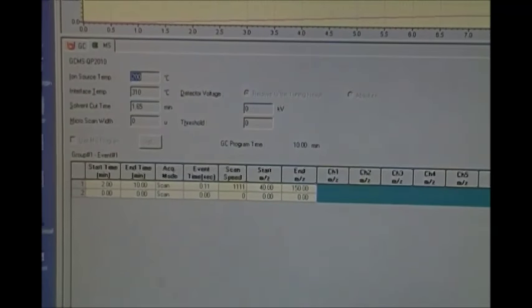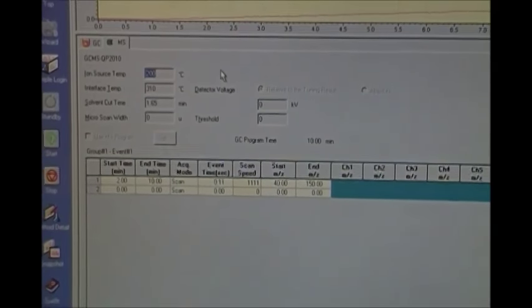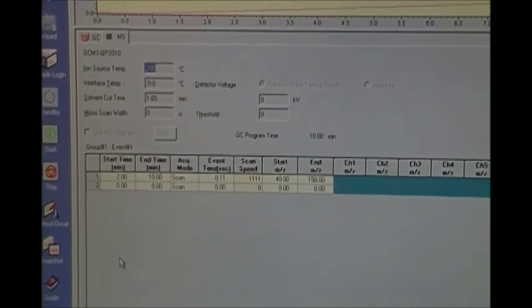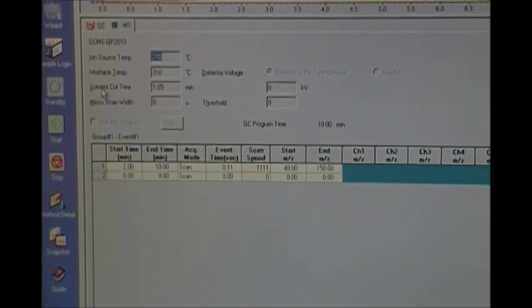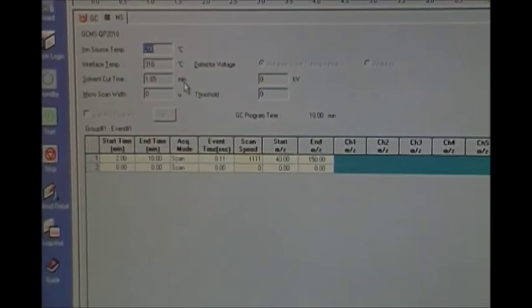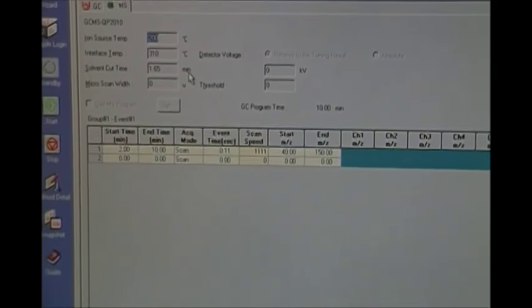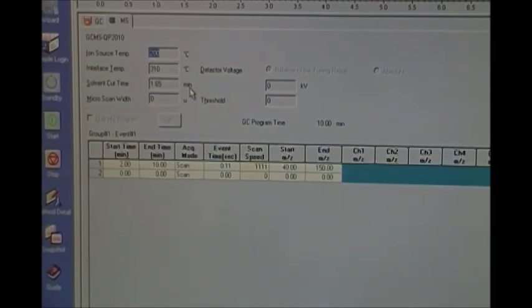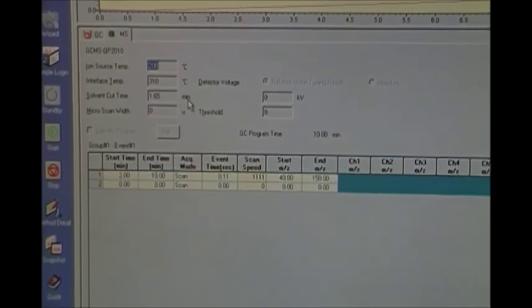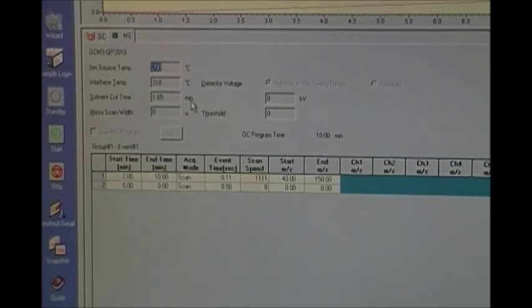And so we'll go over here to our method detail for the mass spec. Some of the things that we want to talk about is our solvent cut time, which is going to be 1.65 minutes. The purpose of a cut time is basically to keep the detector from getting overloaded. We wait to turn on the mass spec detector until most or all of our solvent has left the instrument.